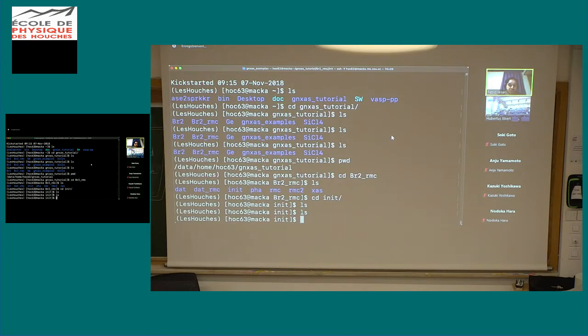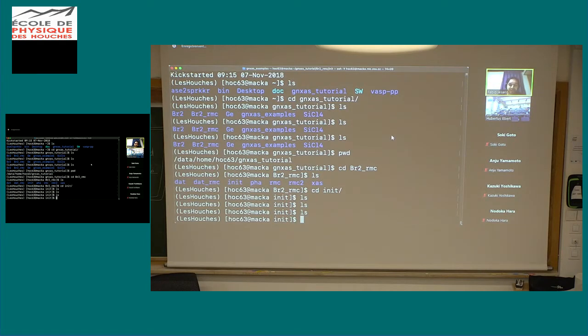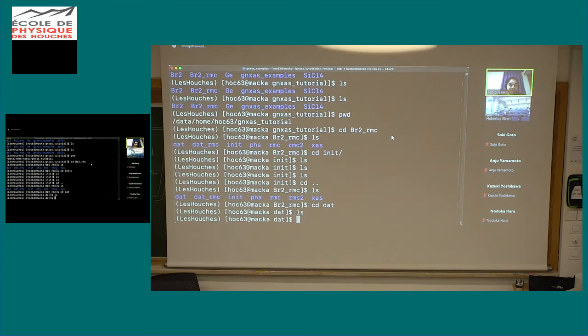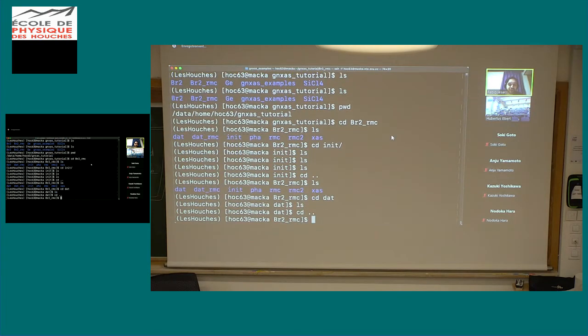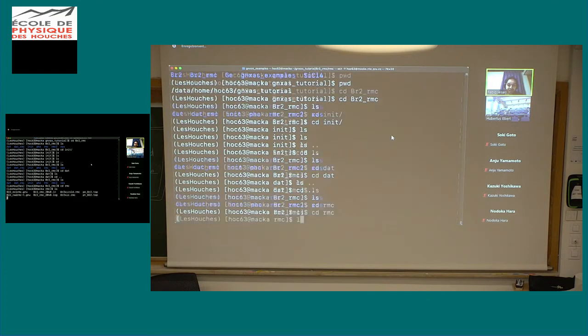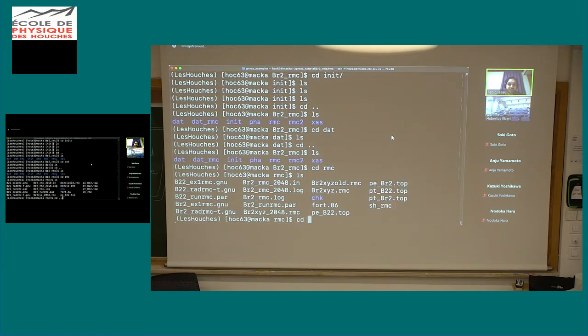I don't know why it's empty. Wait. This is not empty.